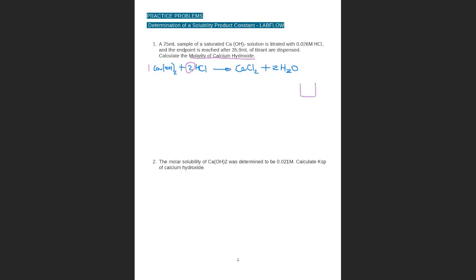You have in a beaker the calcium, the base in this case, and you have a burette, and you are going to add your titrant, which is hydrochloric acid.